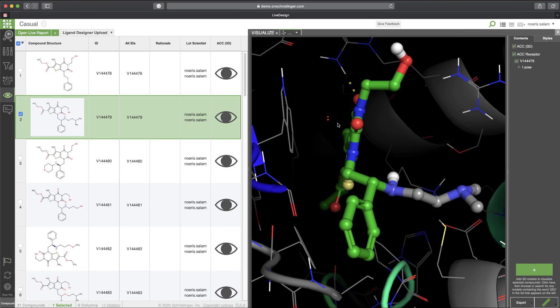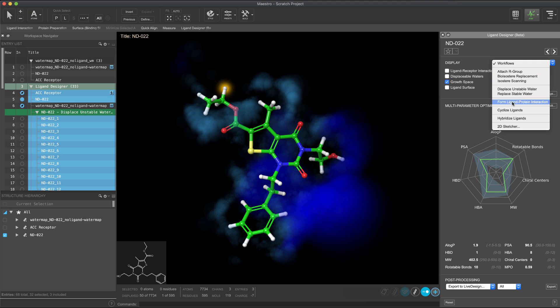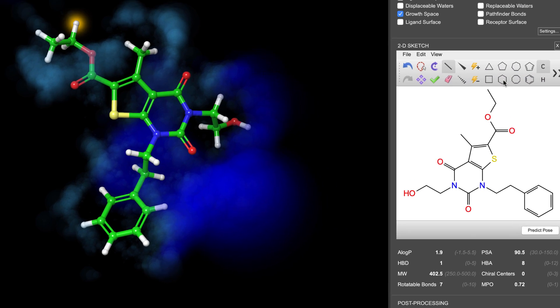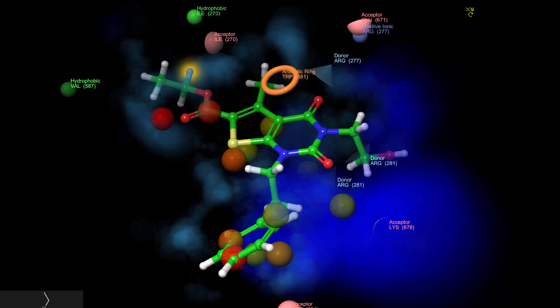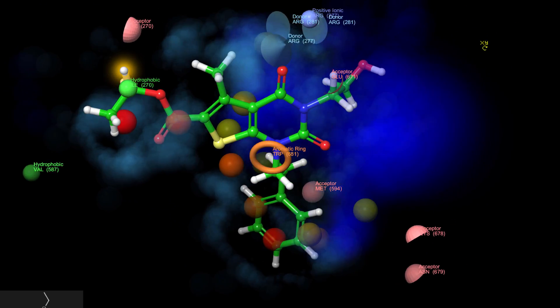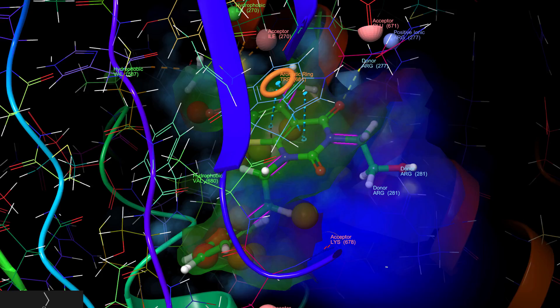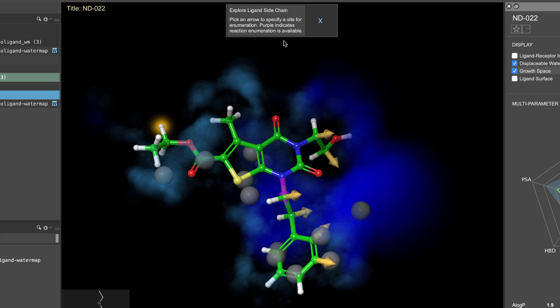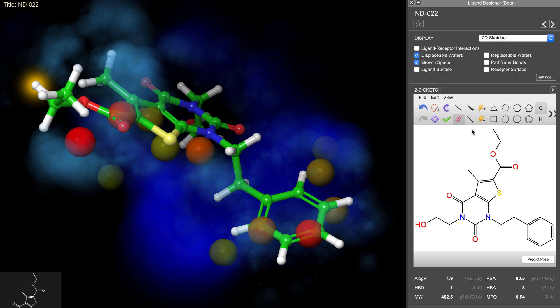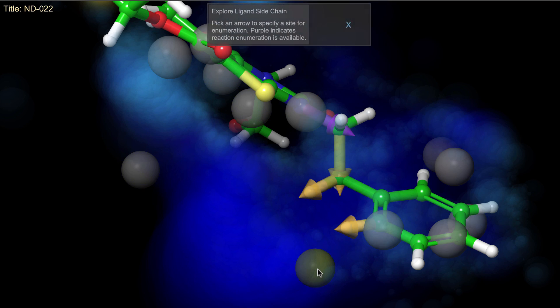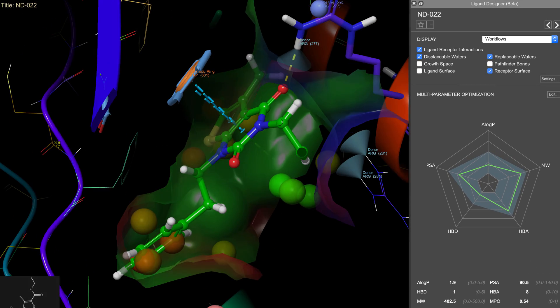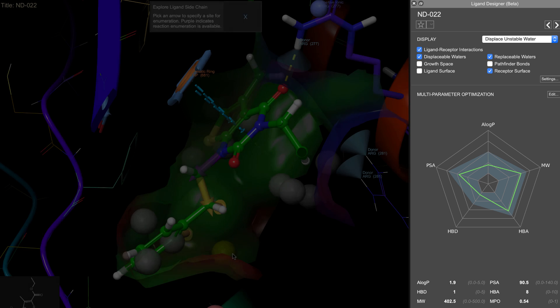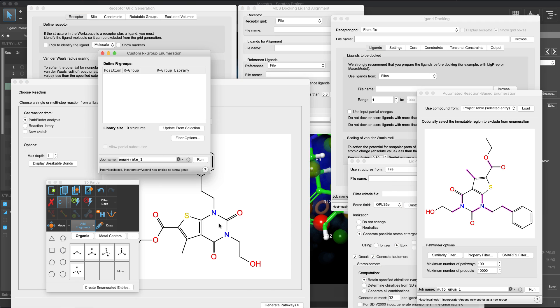In summary, the ligand designer allows you to design your way. Be it through a 2D whiteboard ideation, in a simple 3D view with reduced dimensionality or with the full 3D protein. Use guided workflows to automate ID generation easily or perform changes manually. In short, choose your own adventure. And to do so with just one dedicated panel, leveraging the best of all these panels.